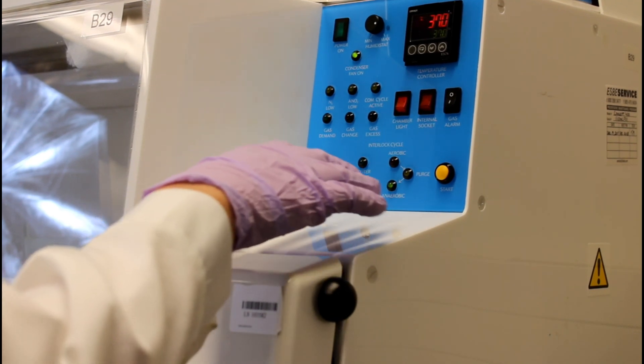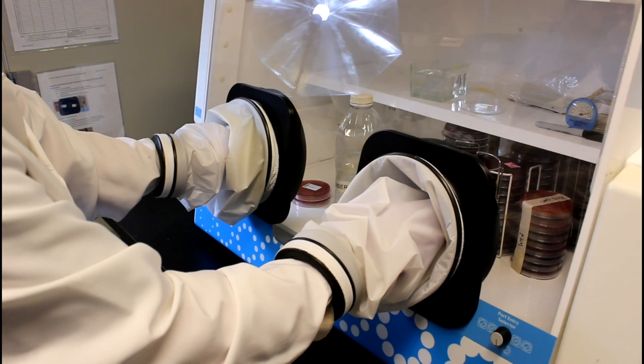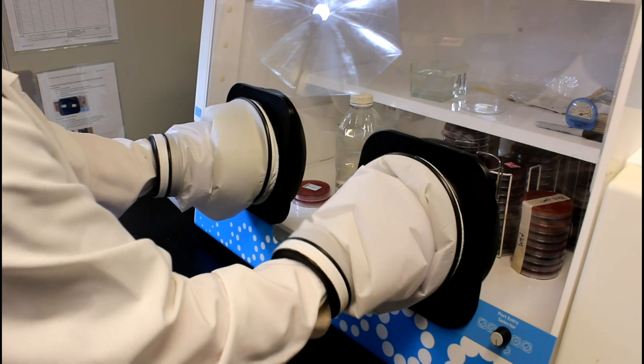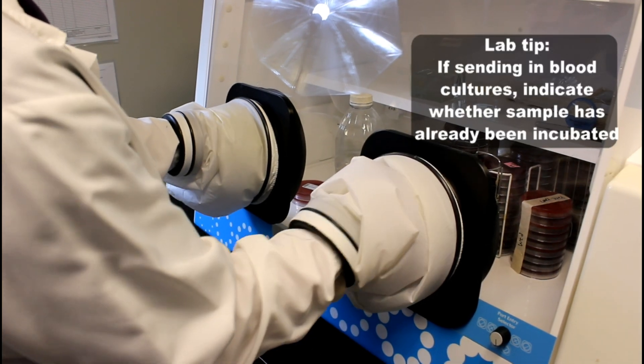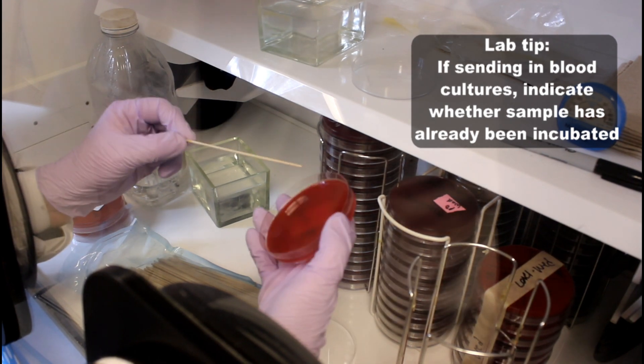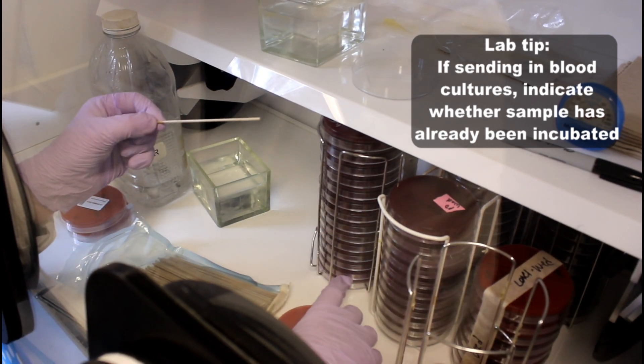After being plated, all samples get incubated for 24 hours before being checked again. Note that if you're sending in blood cultures, please let us know on the submission form if they've already been incubated so that we can process faster.